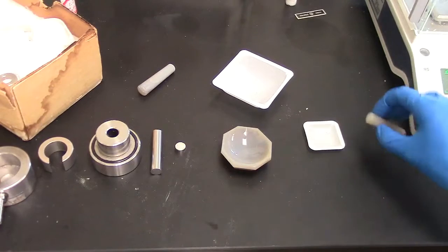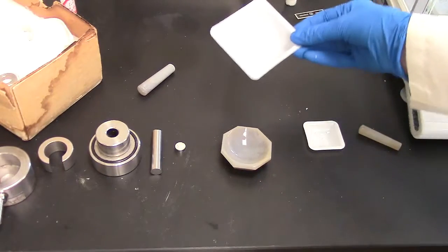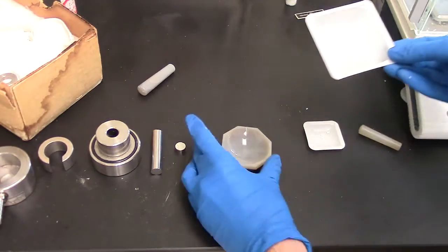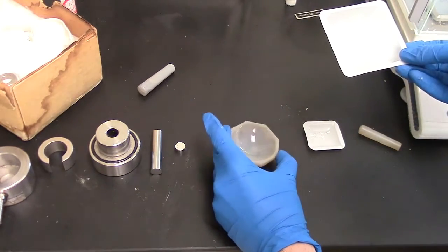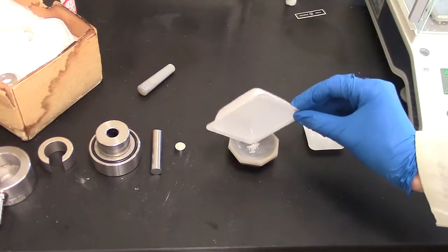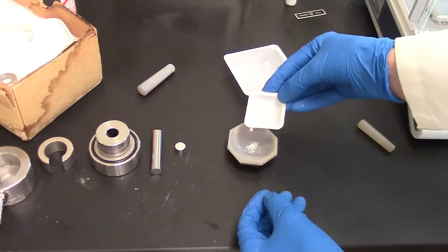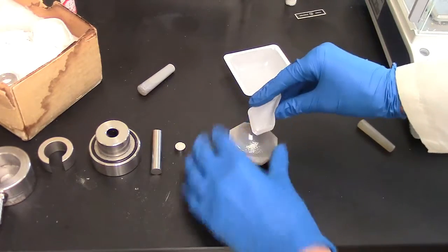The next step we'll want to do is to take our weighed out KBR and stick it in a clean grinding dish. We will also add in our two to three milligrams of our substance.